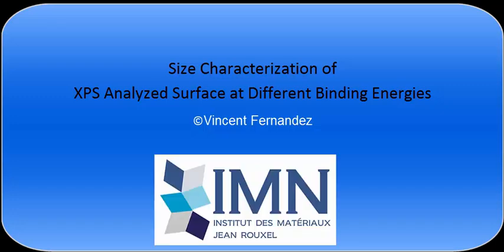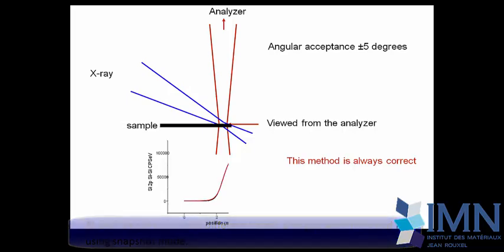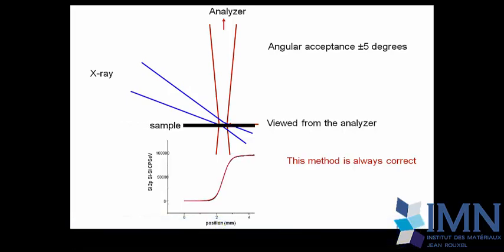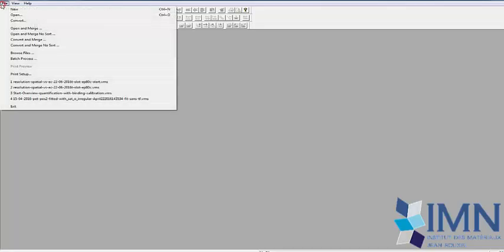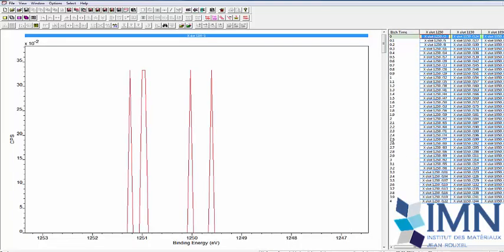It's important to well characterize the instrument. One parameter of the long list of parameters is to characterize the surface analyzed, and this in the different modes that exist in your instrument. One way to work in terms of spectroscopy, independently of the instrument kind, is to move the sample to have a sharp edge through the beam, and this will allow us to characterize the surface analyzed.